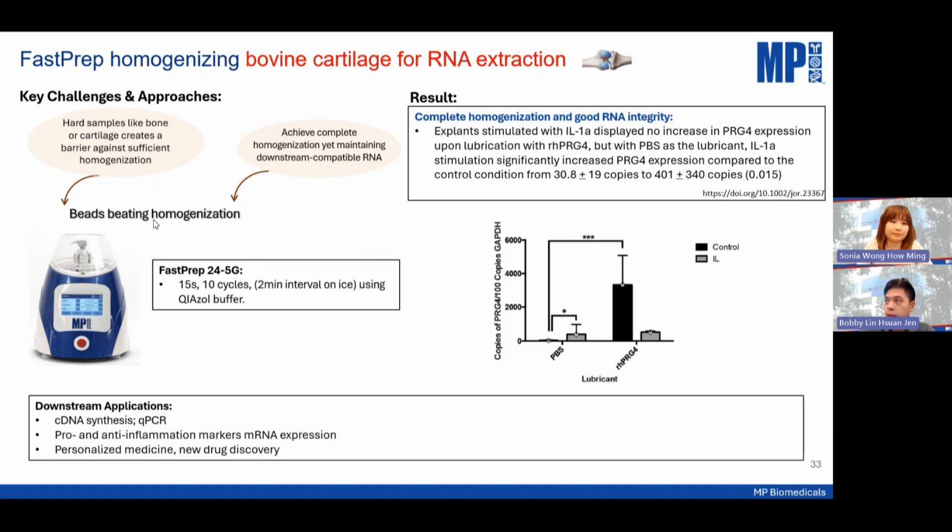Okay, thank you. I think with that being said, we can also use this chance to address one of our customers' questions. I think he is from Korea. He's saying that he is conducting experiments with samples that are not regular hair, but more of a bristle-like sample, such as pig bristles. And because of this, he uses a larger bead size, and he's worried that if he prolongs the beating time, it may damage the sample. So can we give some suggestion or efficient method to process this coarse hair sample while also maintaining and minimizing the damage?